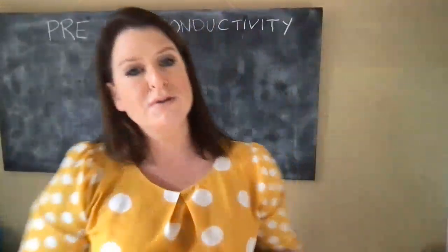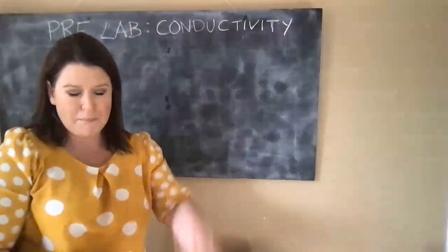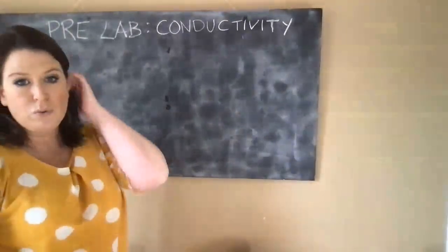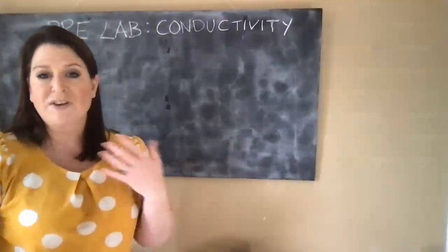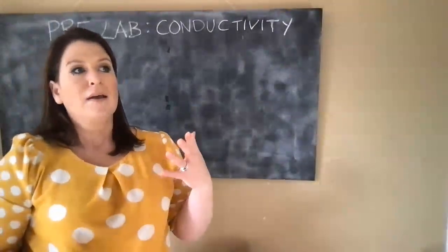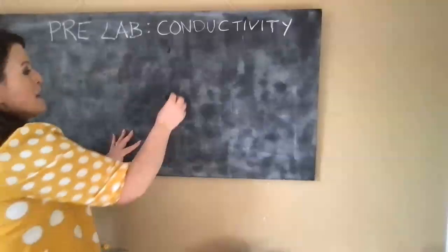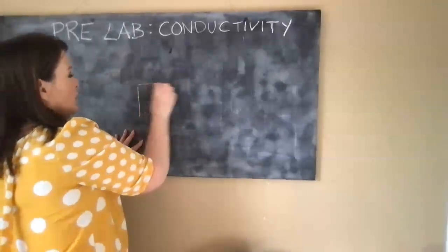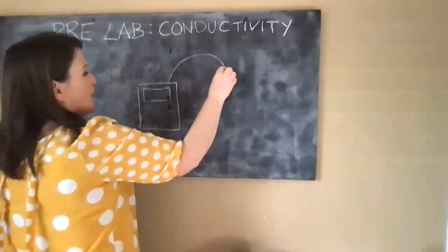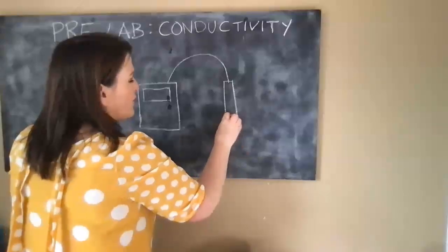You will notice in your experimental manual write-up that part A says we have to look at the probe and calibrate the probe, and we use KCl to do that. So what we do is, I have my probe here, and I sit it into a KCl solution. But why do I need to do this?